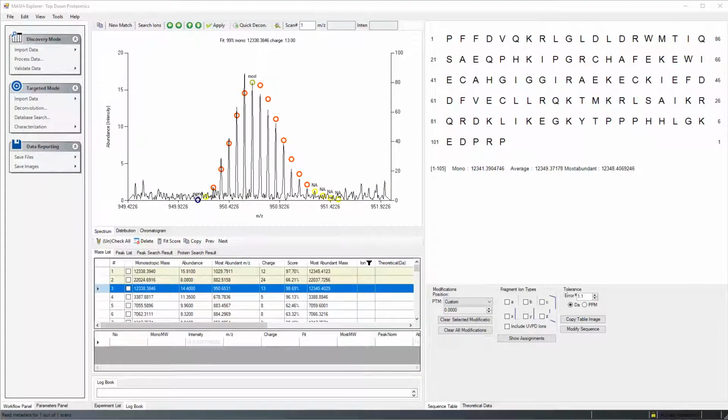Users can change the following properties of the ion distribution to achieve better theoretical fitting to the experimental data. Number 1. Adjust the charge state of the theoretical distribution. Number 2. Plus or minus 1 isotopic unit of the theoretical ion distribution. Number 3. Increase or decrease the signal intensities. Clicking Apply will save the new fragment ion information.